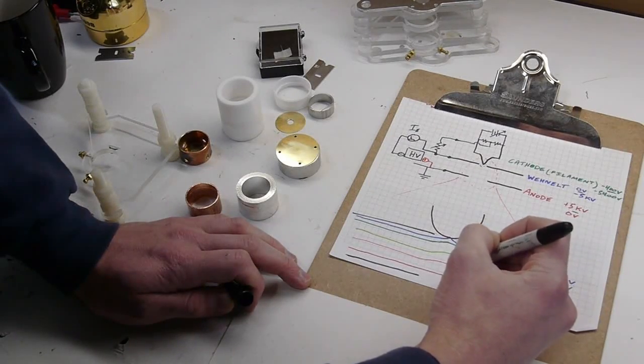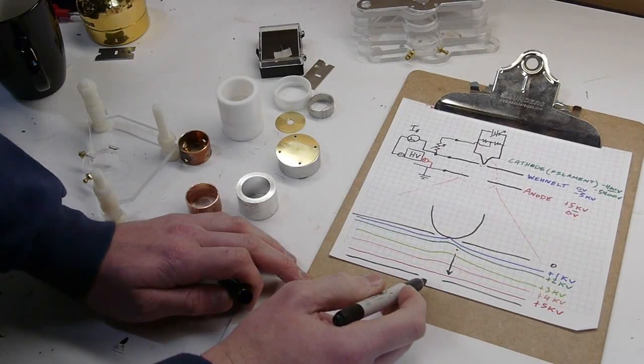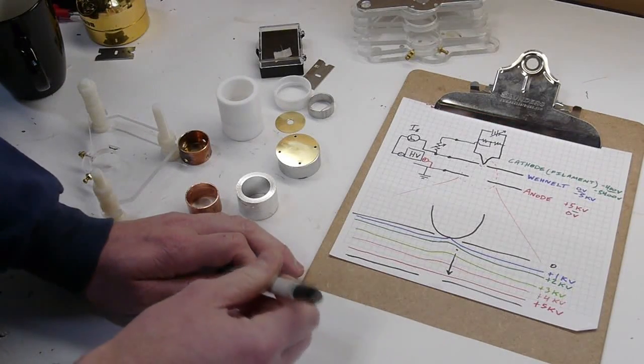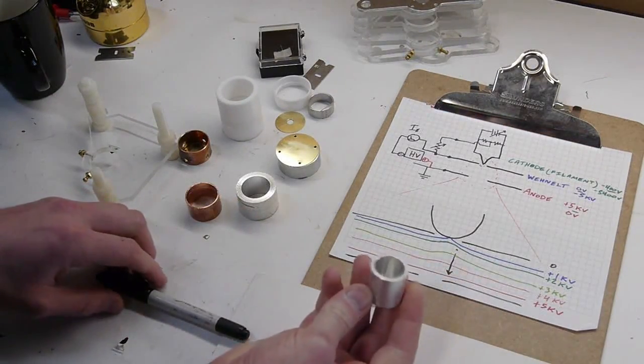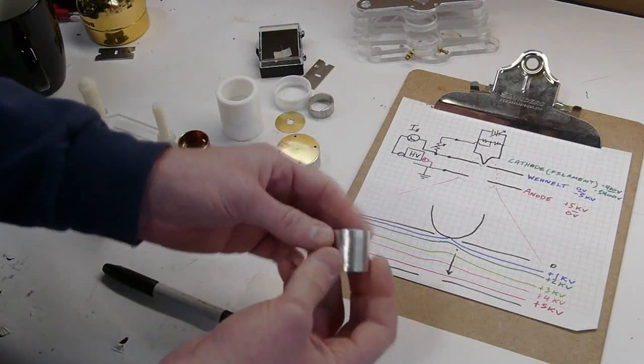So if you're an electron and you're sitting right here, you're experiencing a very high acceleration in the downward direction like this. But as soon as you go through the hole in the anode, there's no more field.